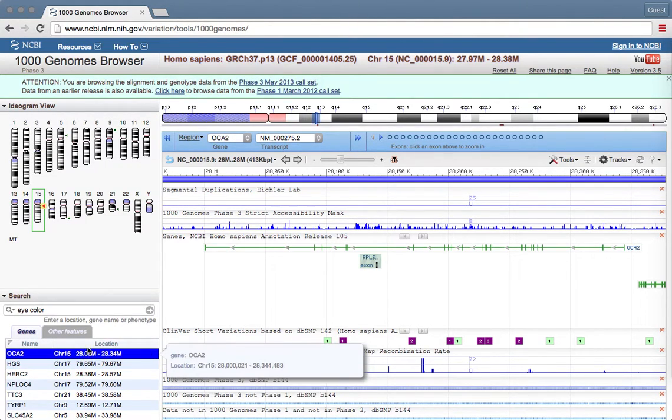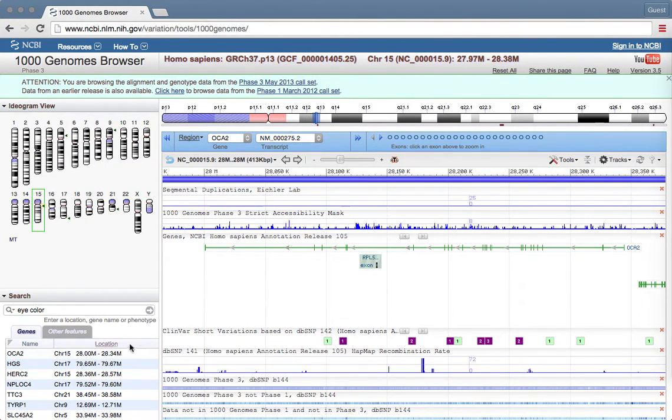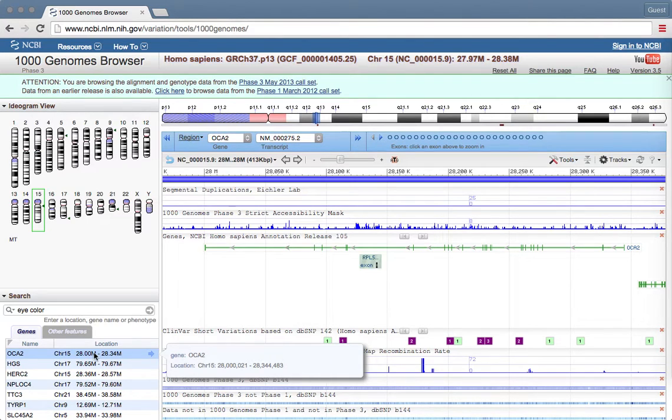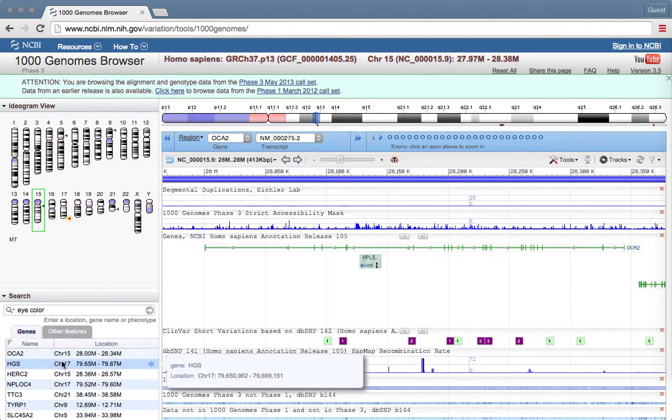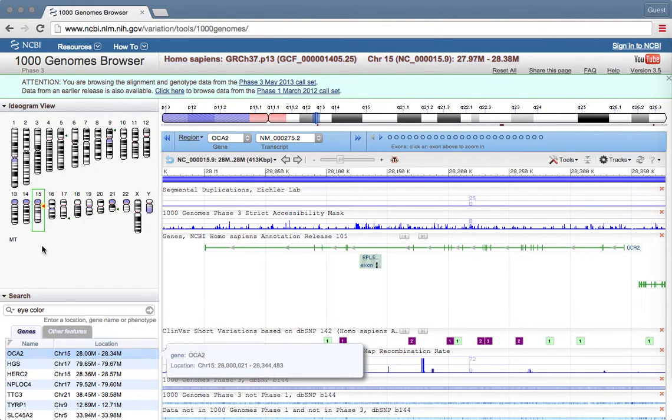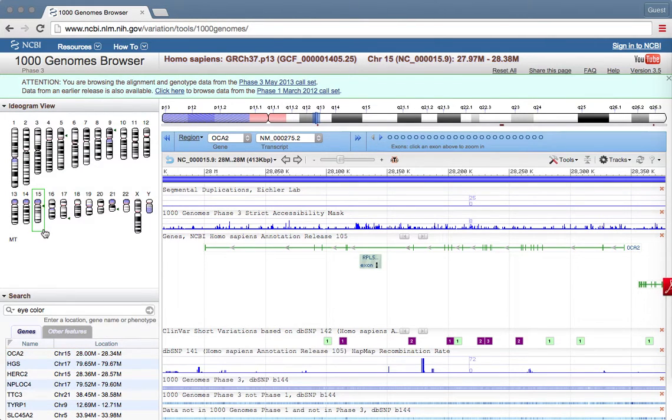Here, it's telling me OCA2 is a major gene that scientists have discovered is related to eye color. It also tells us where OCA2 is located. Here, it's telling me that OCA2 is a gene located on chromosome 15. It's showing me that in this picture up here.